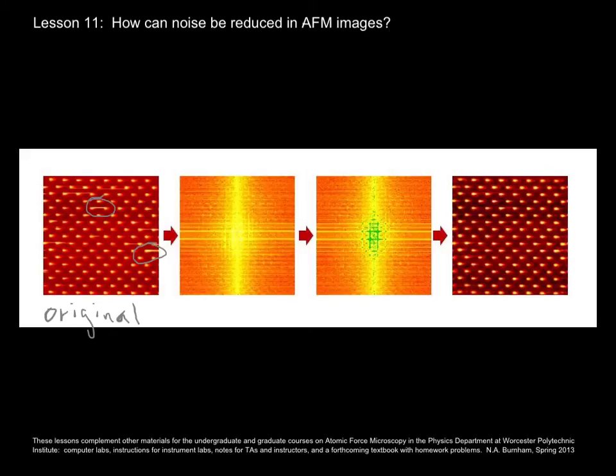And there are situations where you will want the viewer of your image to focus on what's important about it instead of distracting streaks. The sample is particularly difficult to image because of the sudden changes in height. So we want to get rid of these streaks. We do the Fourier transform.